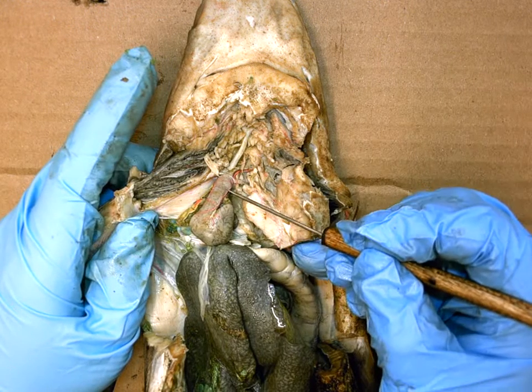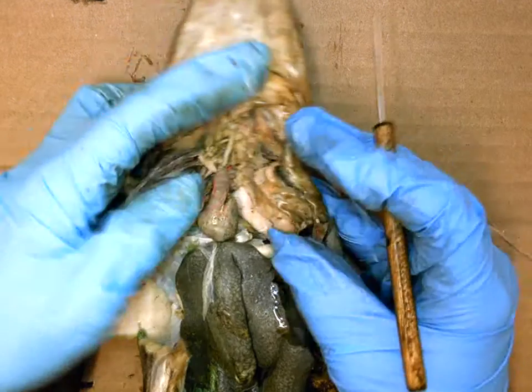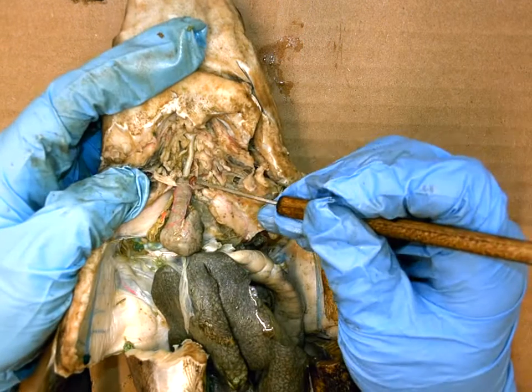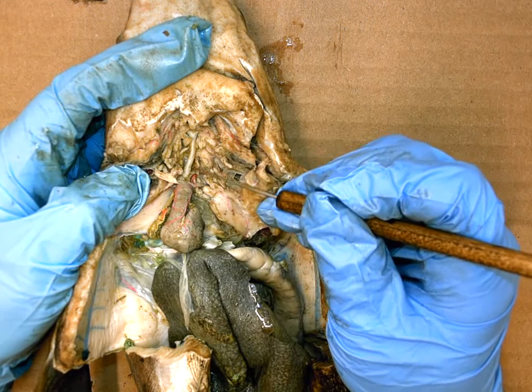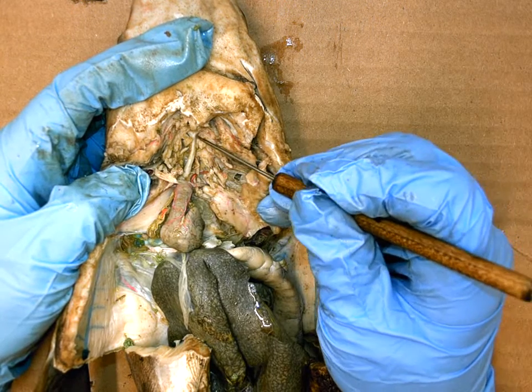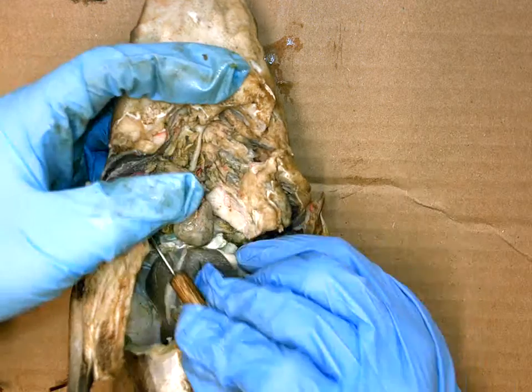The first blood vessel out of the heart is called the conus arteriosus. The conus arteriosus then narrows into a single white blood vessel running along the belly of the shark — this is the ventral aorta. The ventral aorta then branches out to the sides.